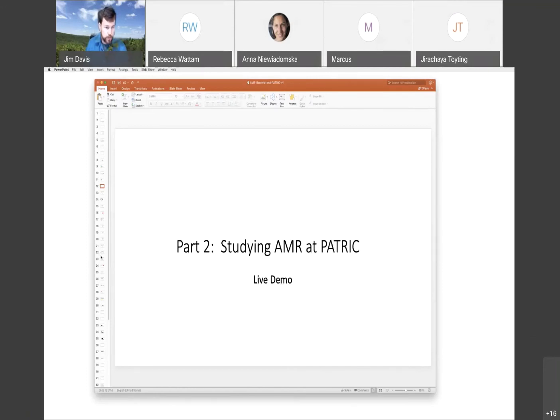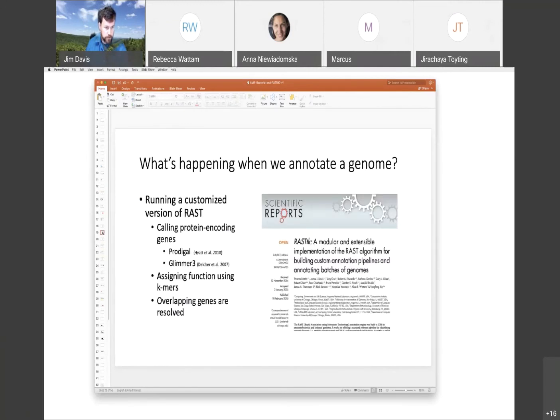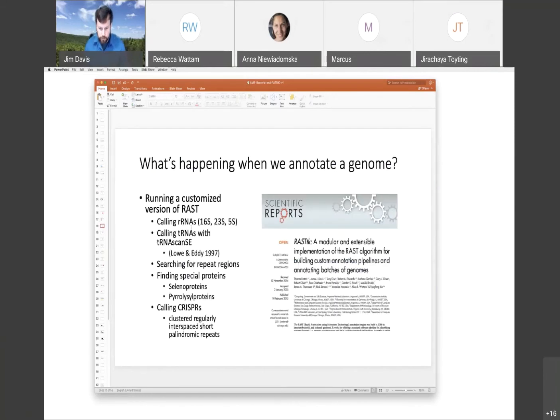So I had some still shots in here so that, okay, this is it. This is where I need to be. So while that's running, I wanted to kind of describe what we just did.